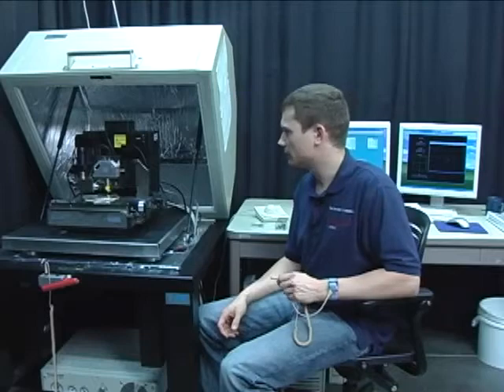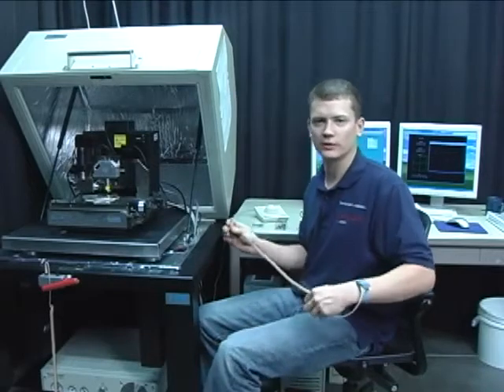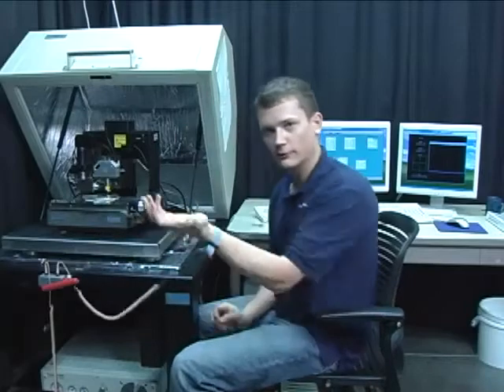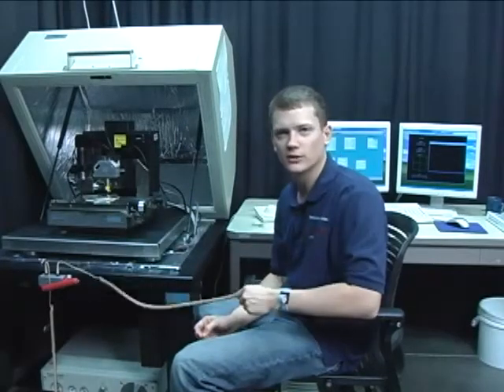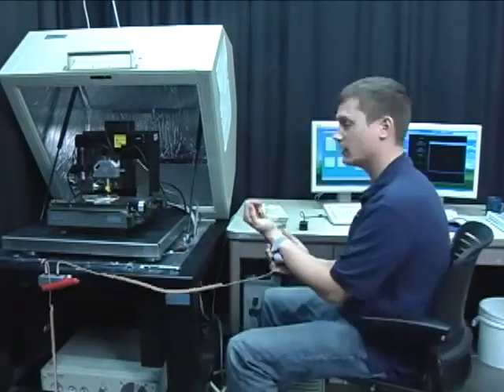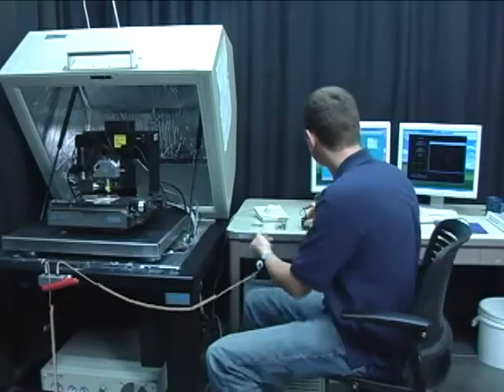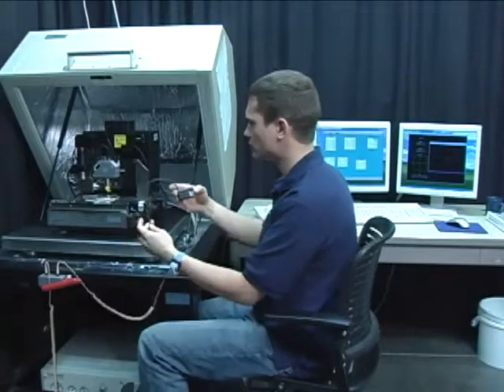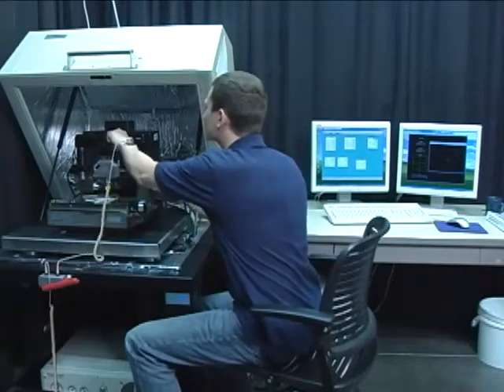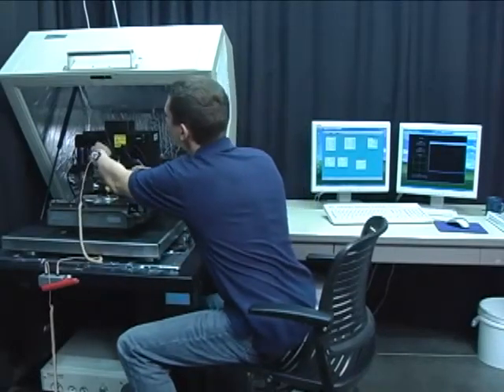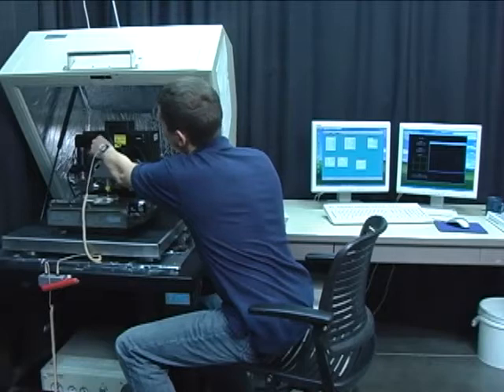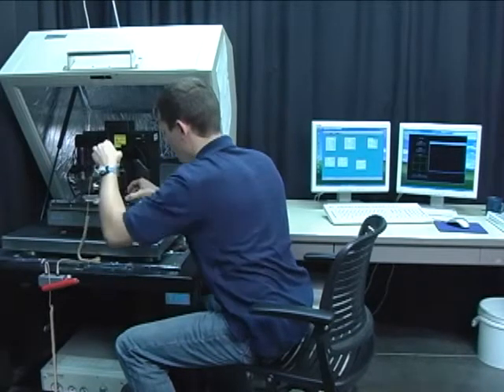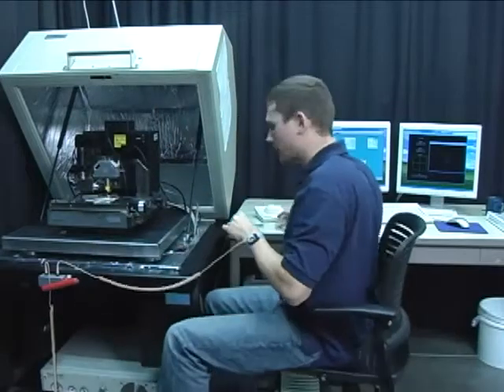Okay, so the other thing, I will install the conducting tip module and prepare the instrument to take measurements. So I start off by grounding myself because I'm going to be dealing with sensitive electronics and we don't want to damage them. This is the conducting tip module which I plug into the appropriate port on the instrument and then I calibrate.